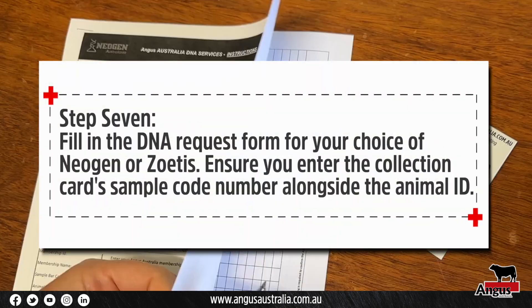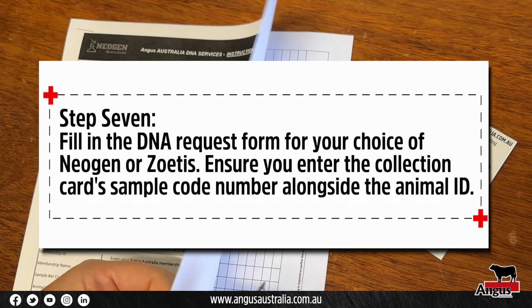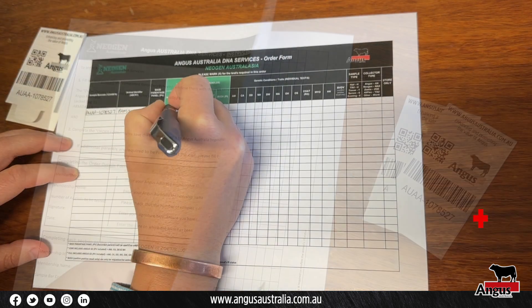Fill in the DNA request form for your choice of Neogen or Zoetis. Ensure that you record the collection card sample code number alongside the animal's ID.